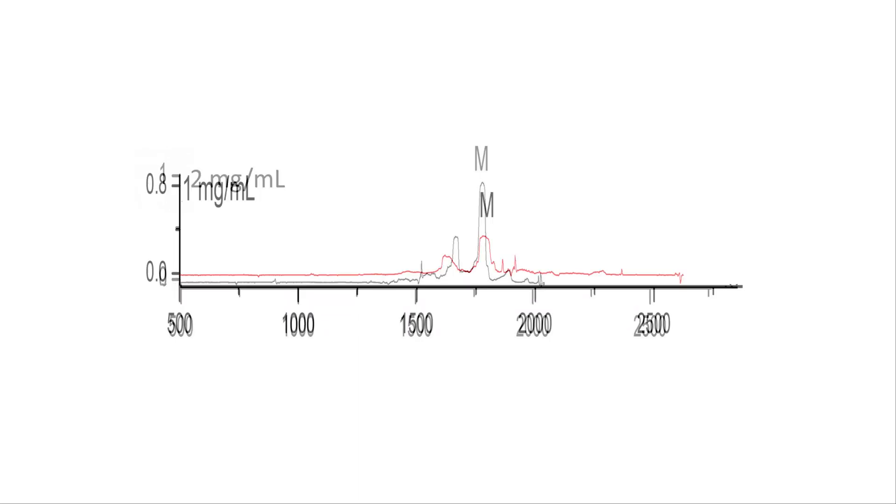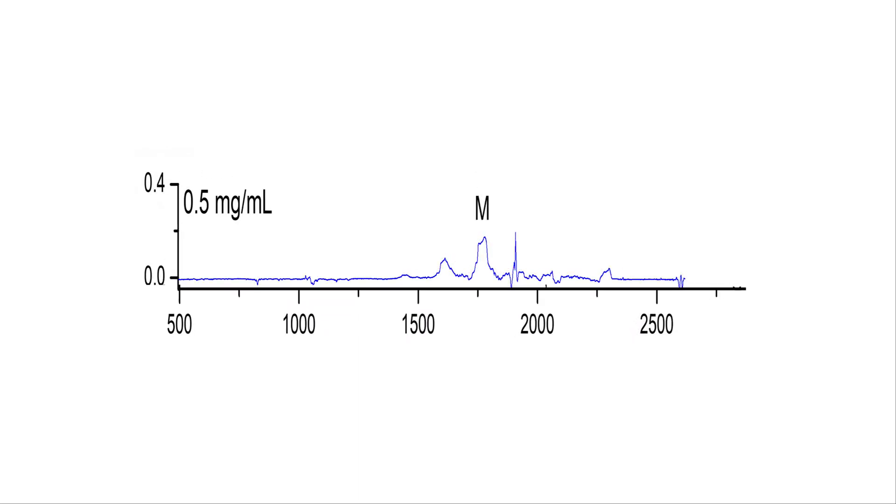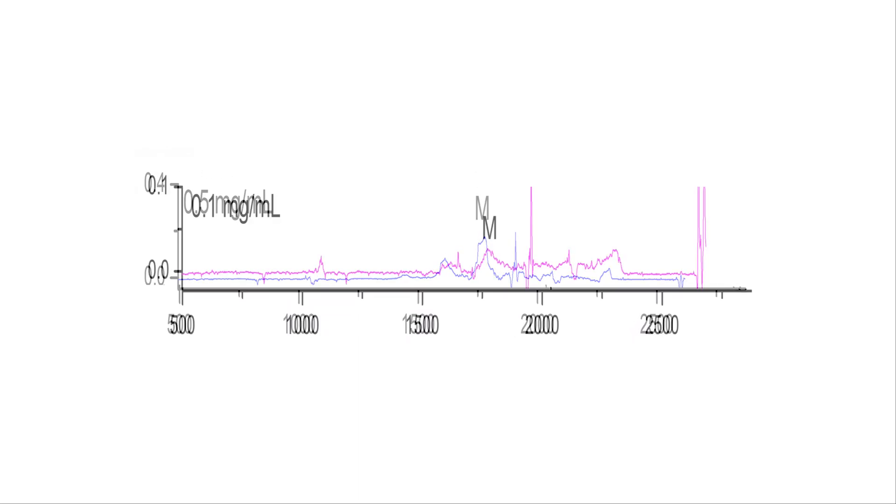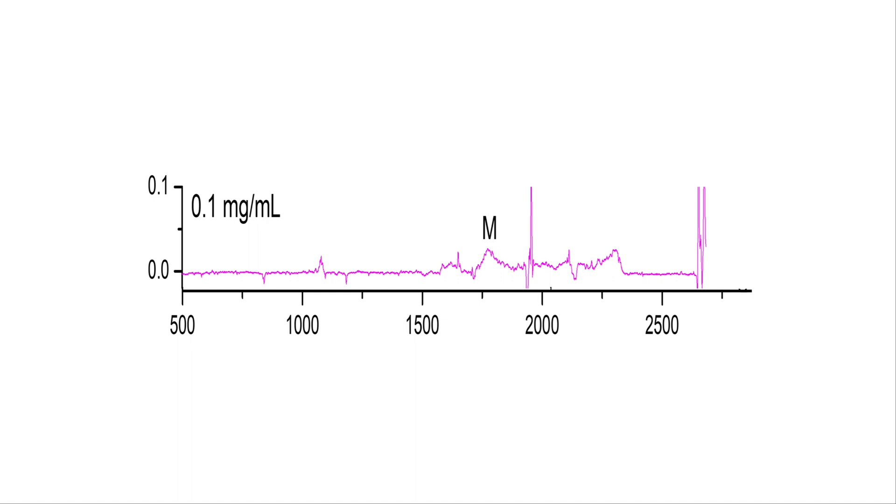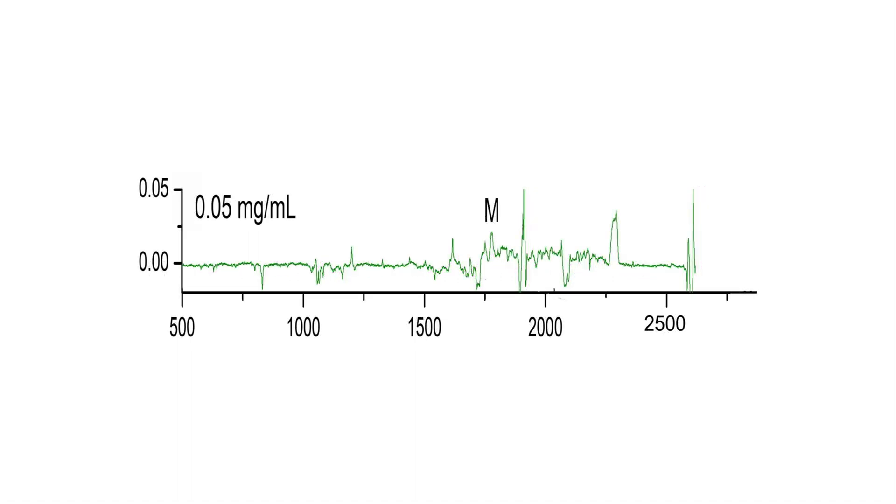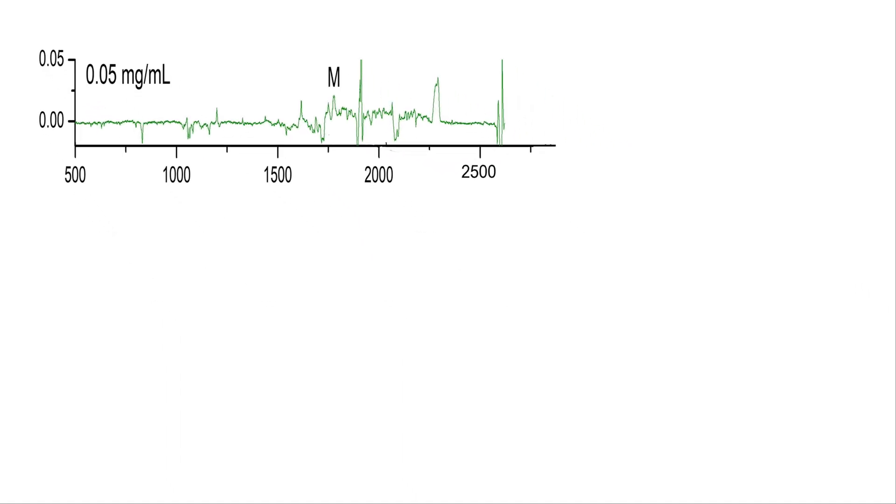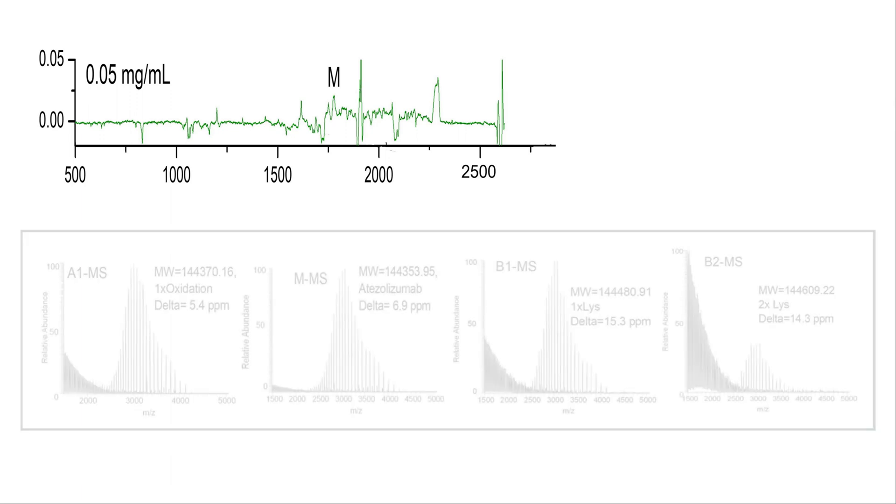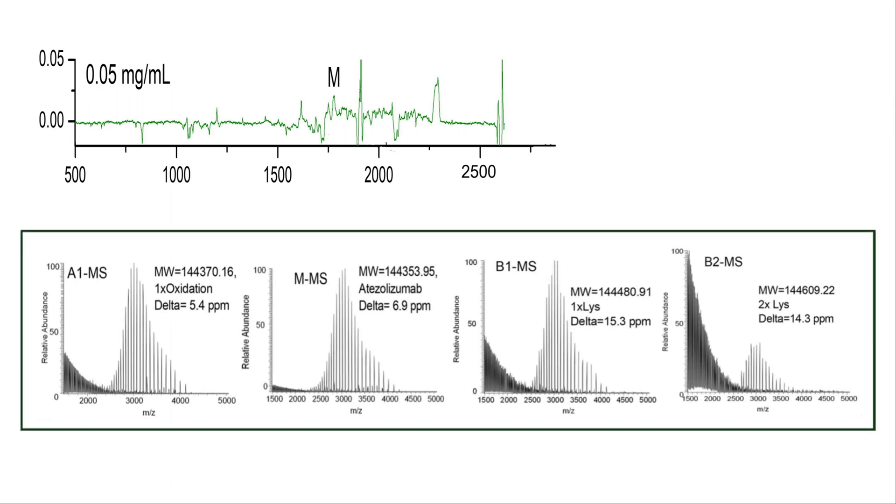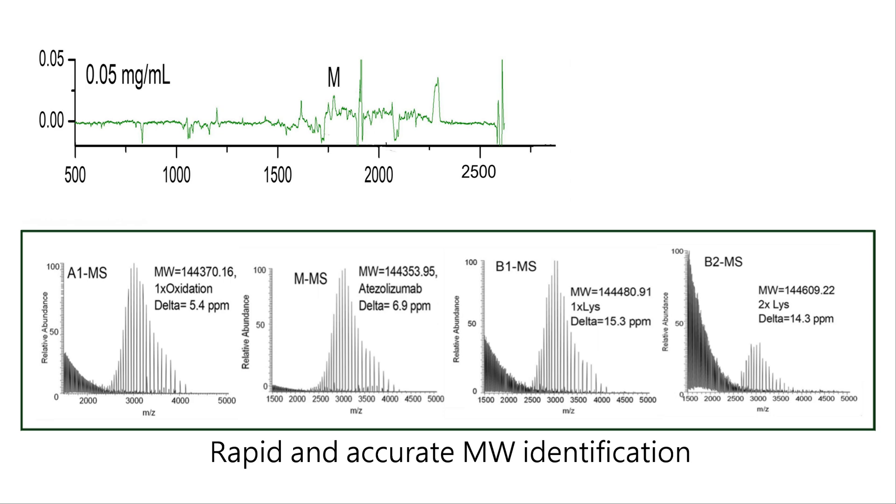With an extremely high sensitivity, our platform can provide accurate MS identification for sample concentrations as low as 0.05 milligrams per milliliter. Even at this low concentration, charge isomer peaks are visible in the total ion chromatogram and can be deconvoluted to obtain intact molecular weight identification.